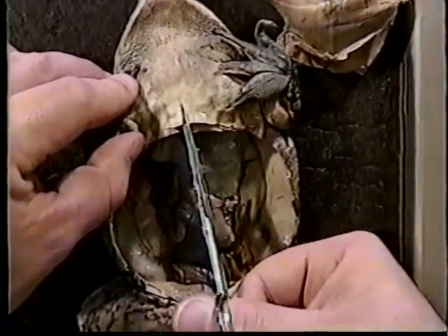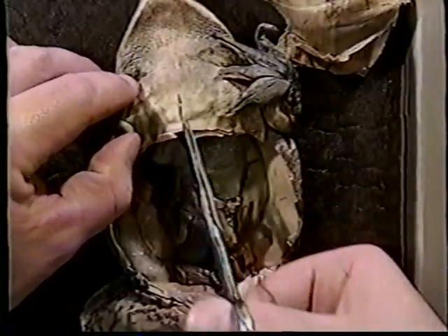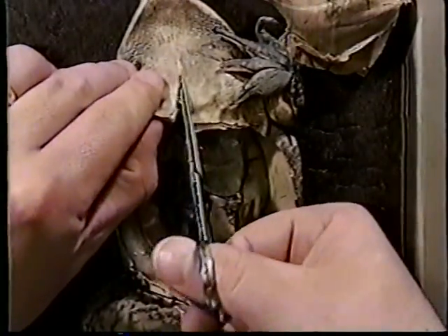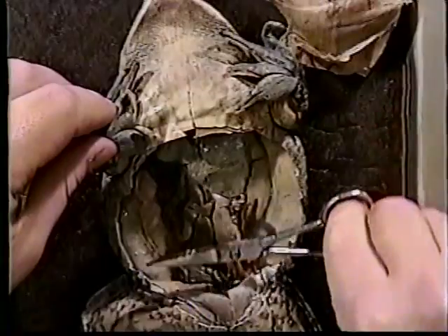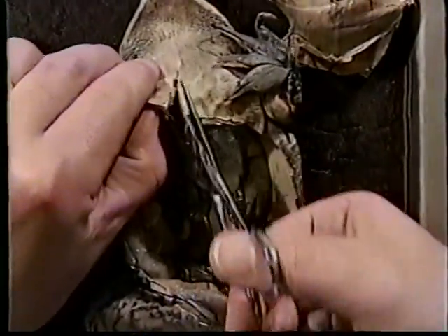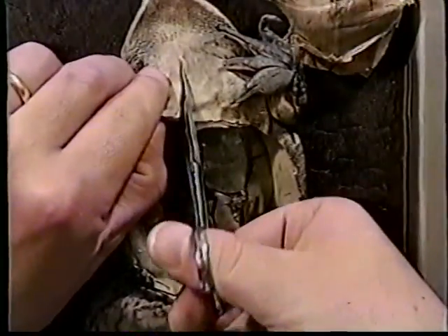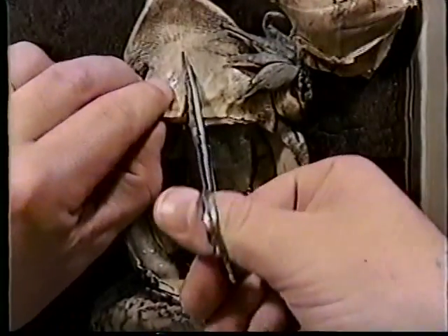At this point, it might prove to be beneficial to use the scalpel if you're having great difficulty cutting through, as this breast area of the frog is much tougher than the abdominal area. Again, I want to do everything I can to avoid cutting too deep.